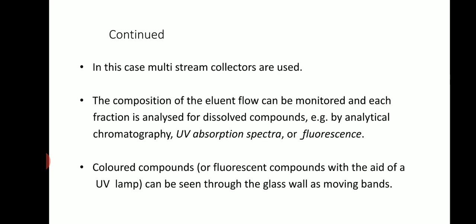In this case, multi-stream collectors are used. The composition of the eluent flow can be monitored and each fraction is analyzed for dissolved compounds, for example by analytical chromatography, UV absorption spectra, or fluorescence. Colored compounds can be seen through the glass wall as moving bands.